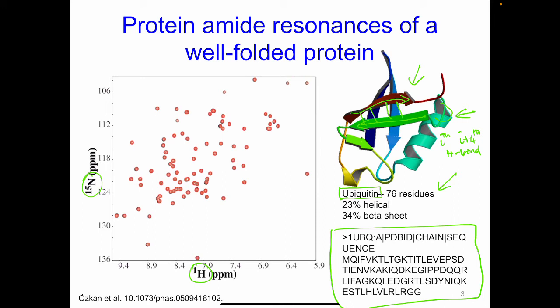And if you recollect, the proline residue does not have an amino proton following the polymerization. So therefore, the three proline residues that are present in this protein ubiquitin will not be observable in the NH correlation spectrum. But otherwise, you would end up seeing one NH resonance like this for each amino acid that is present.